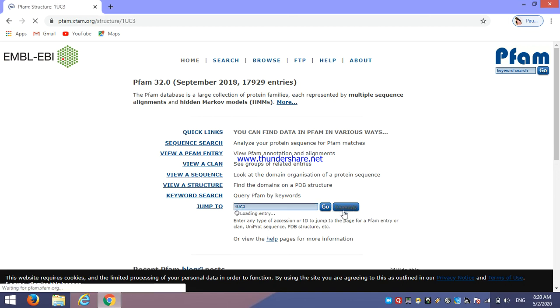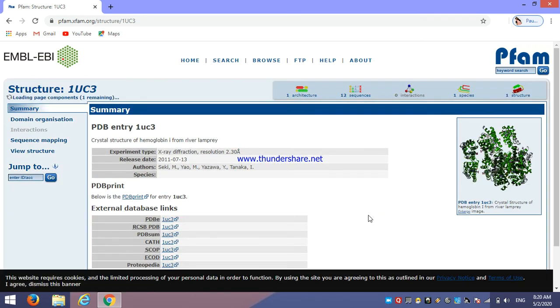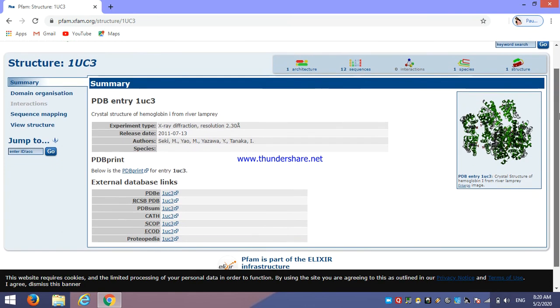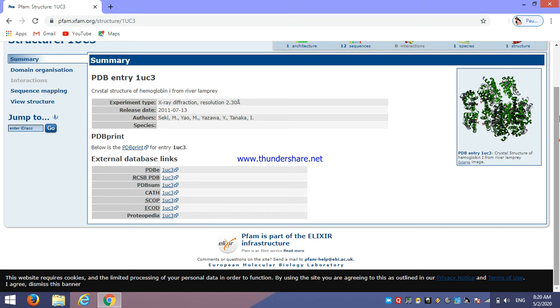Here you can see the example. You can find particular example how to identify this. So this is our summary result which includes the experimental type. That means it is from X-ray diffraction method. Then there are different databases linked, like PDB or SCOP or CATH, whatever these are related to protein databases.